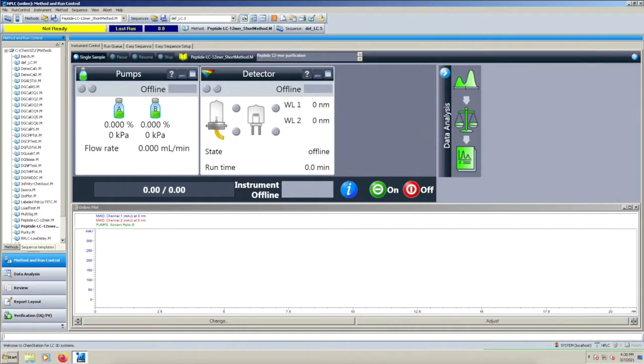Make sure that you then remove the pump heads from the 20% ethanol solution and rinse well with water and dry blot with a chem wipe.